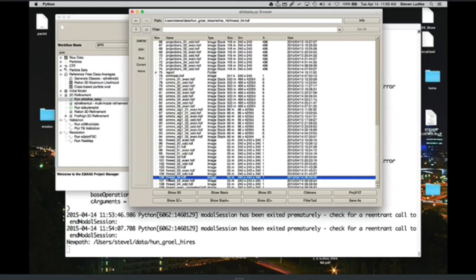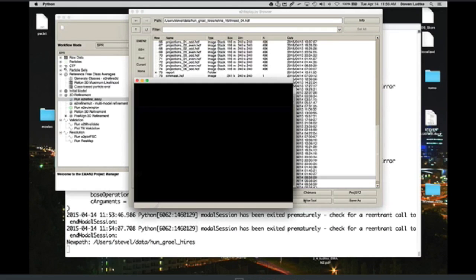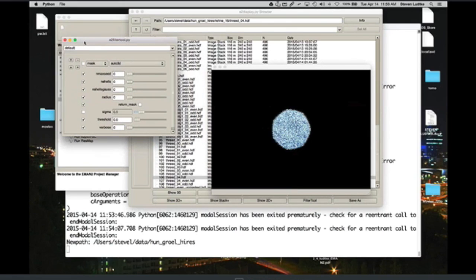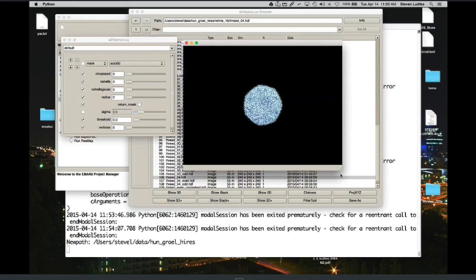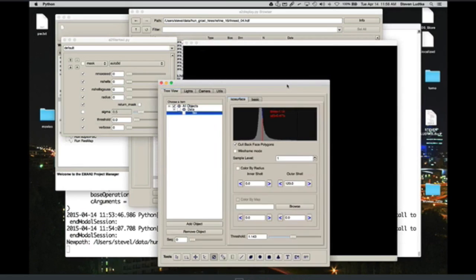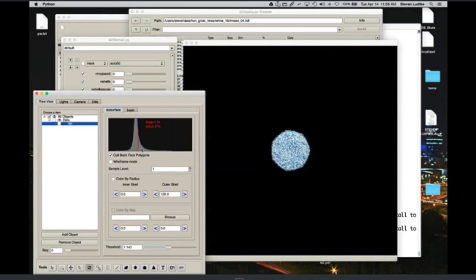One other thing I haven't shown you, and this works both for 2D and 3D, is this filter tool program. And I guess I'll probably stop with that. I mean, we've only touched on the highlights of the system, but we'll probably stop after this. So if I launch this filter tool application, it will open a window containing whatever image I'm interested in, image volume, whatever it is. And let me play with the isosurface threshold a little bit.